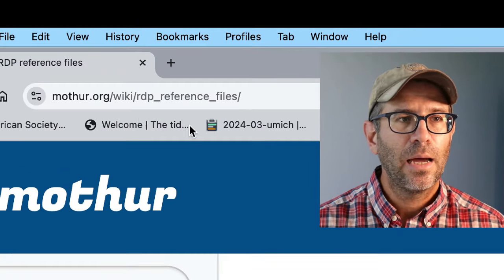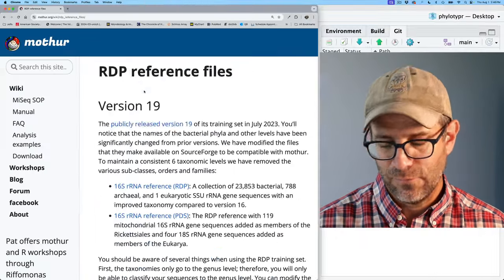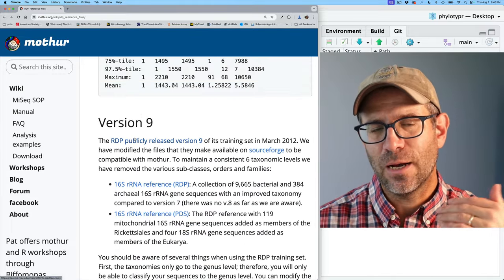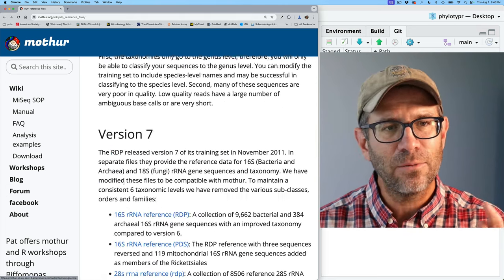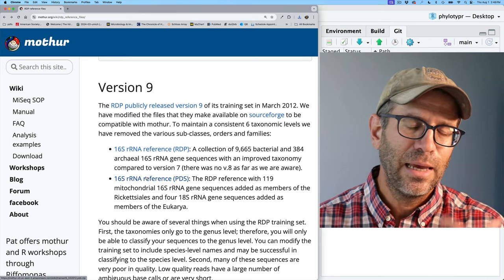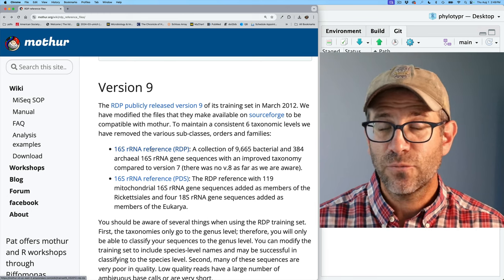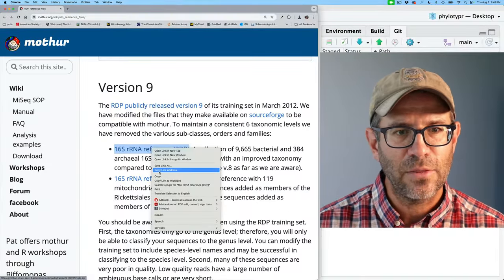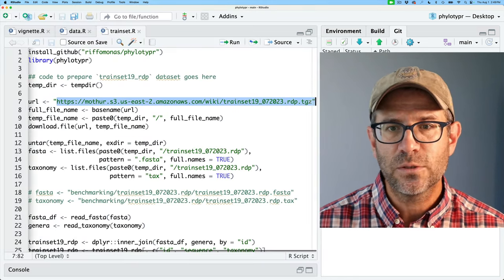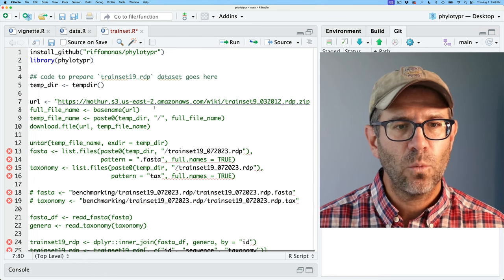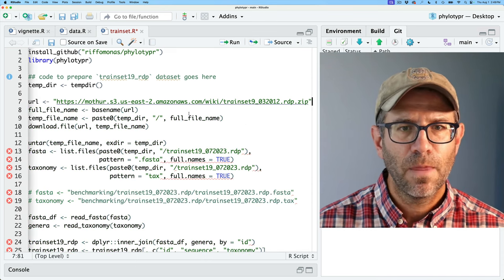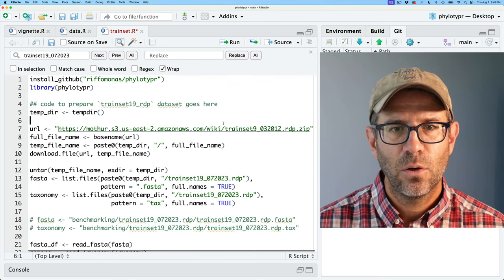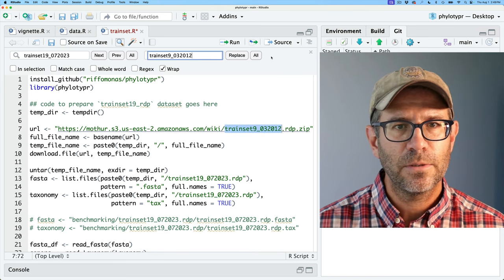Coming over to the mothur wiki, I have a directory for RDP reference files. At the bottom I see trainset6, but the version in the MiSeq SOP is version 9, which is a few versions newer. I'll roll with trainset9 since that's what I use in the MiSeq SOP and I'm familiar with it. So if I hover over the link for the 16S rRNA reference RDP, I can see the URL in the lower left corner. I'll copy that link address and paste it into my trainset.r. And now wherever I have trainset19.072023, I'm going to find and replace it with the trainset9 version.